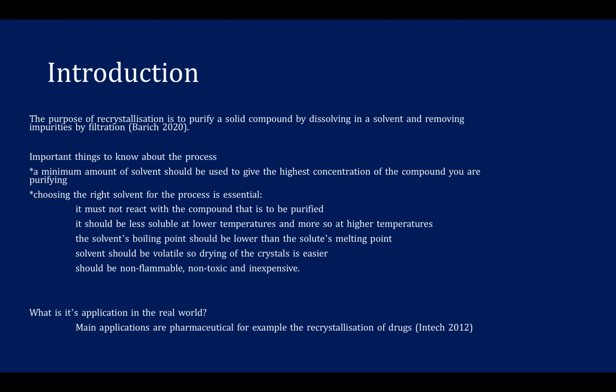So, what is this experiment about? Recrystallization is purifying a solid compound by dissolving in a solvent and removing impurities through filtration techniques. Selecting the most appropriate solvent is essential, and you also want to use the minimum amount of solvent required to maximize the concentration of the compound you are purifying. The solvent used in this recrystallization is water.